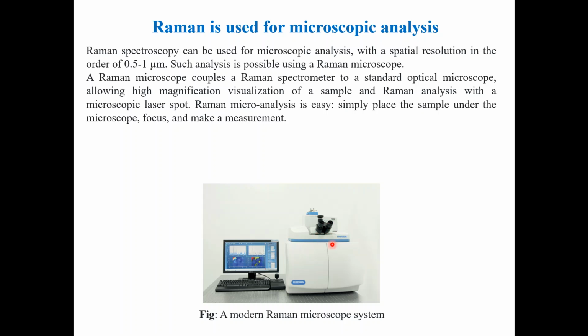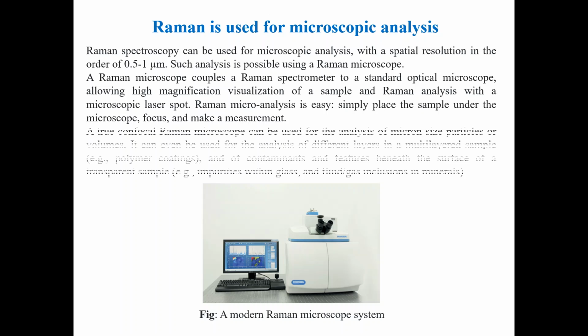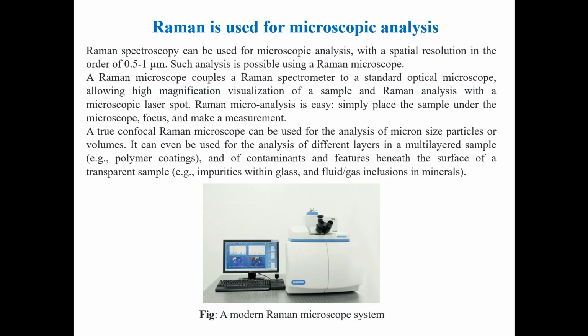So Raman micro analysis is very easy. How easy is that? What do you actually need to do? You simply place the sample under the microscope, focus it, and make the measurement. You just need to put the sample, focus it with the help of the optical microscope, and then take the measurement. So it's a very simple analysis. You don't need special training for sample analysis with a Raman microscope.